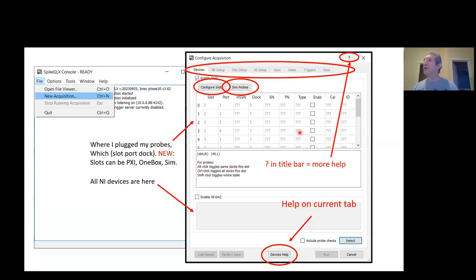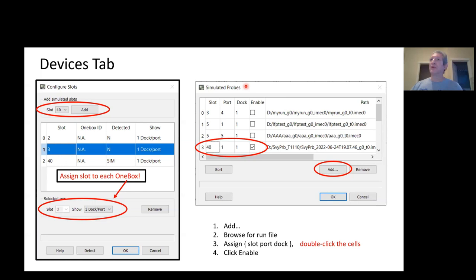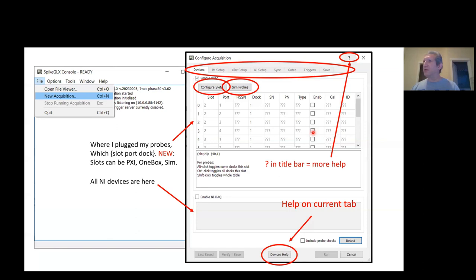Let me talk briefly about virtual probes. We have the ability now to replay an existing data file back through SpikeGLX if it came from a real probe. To do that, click on Simulated Probes. That brings up the dialog on the right. You can browse for any file that you already have and assign it a slot, port, and dock. So now when you check the box for that slot, port, and dock, the data will be coming from a file instead of from a real probe.